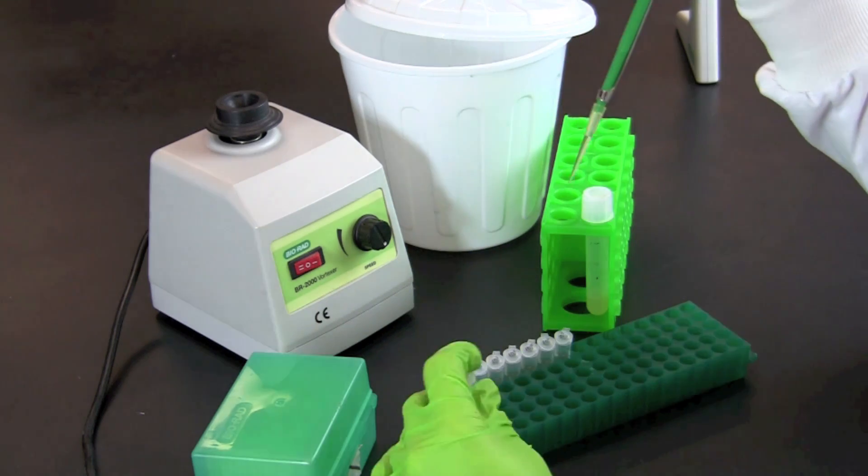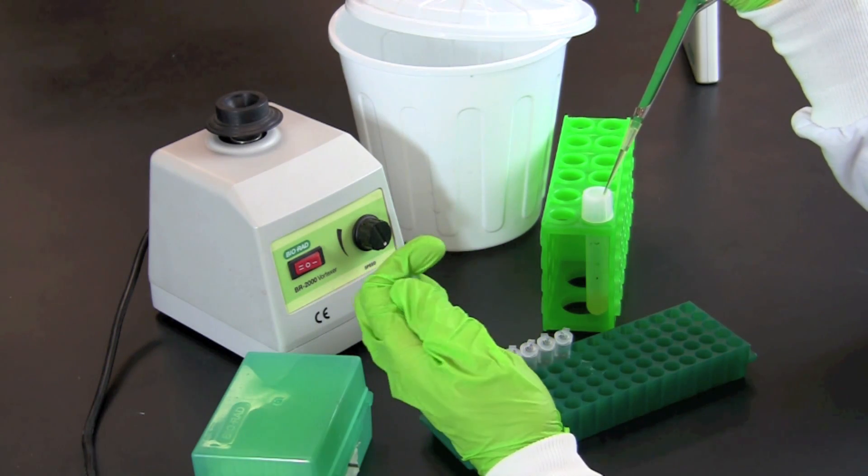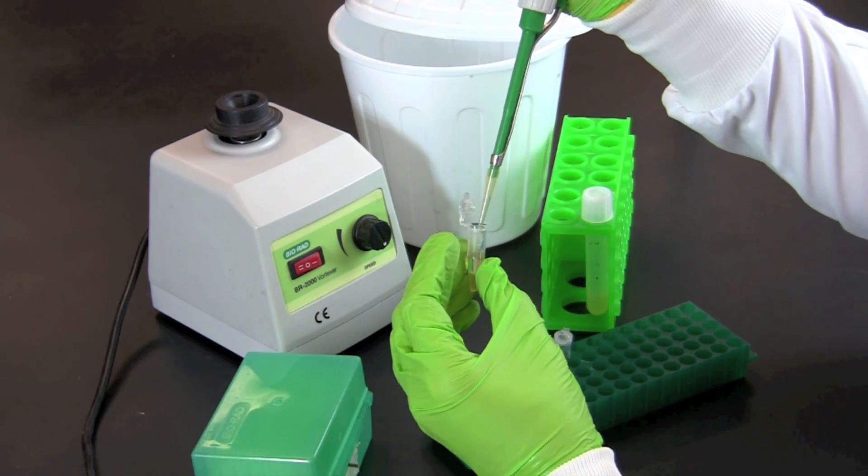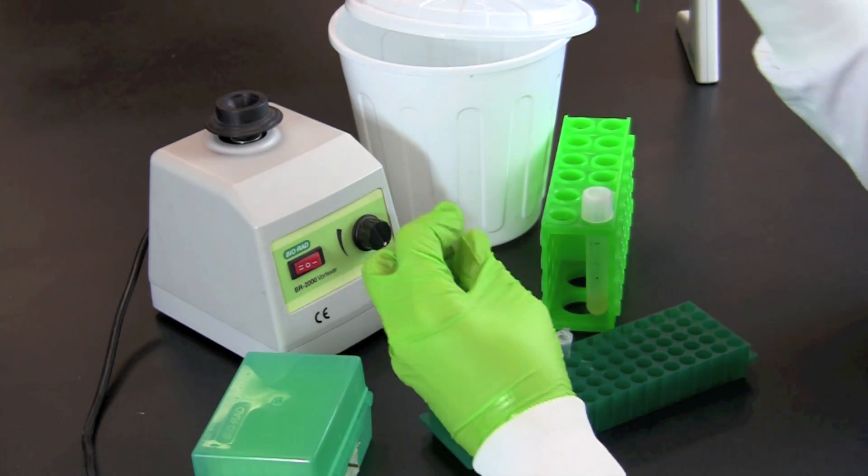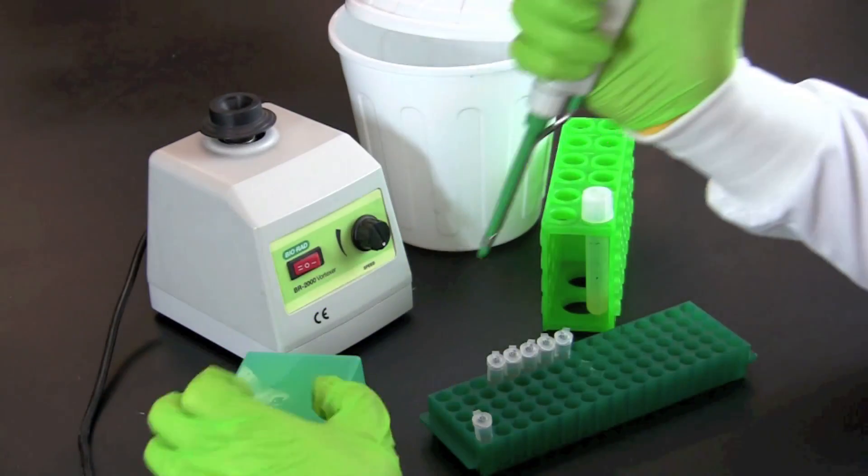Remove 100 microliters of diluted cell culture from the tube labeled 10 to the 1st. Mix by vortexing or pipetting up and down at least 5 times.